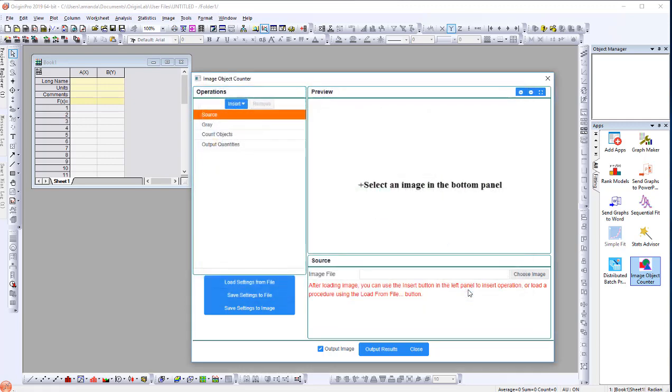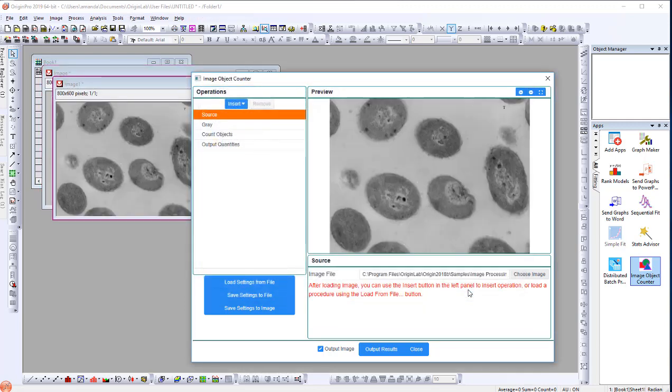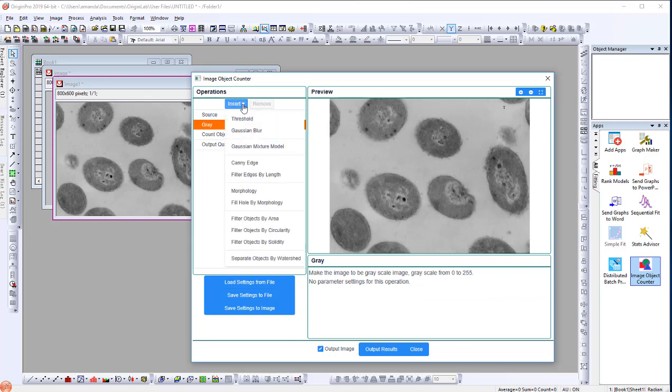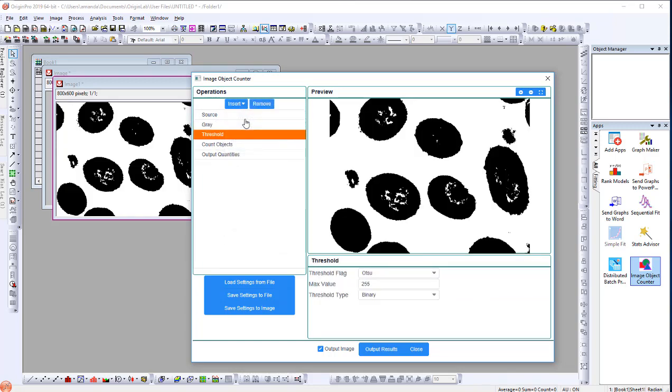Now, first select the gray operation. This operation converts the image to gray scale. Now, select Insert and select Threshold to insert the threshold operation after the gray operation.